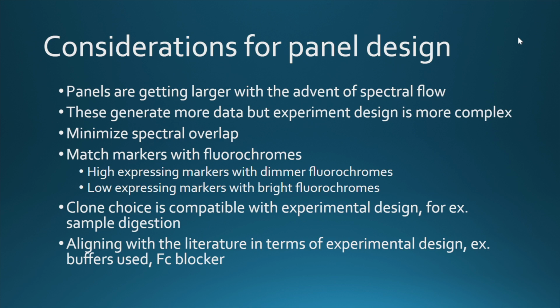But generally this mostly boils down to the spillover, I'm using it here as a general term, how much spillover or spread one fluorochrome is having into another. Again, you want to have resolved fluorochromes, resolved dyes, resolved signals, not interfering with each other, so that you're able to get and measure each marker separately with great precision.